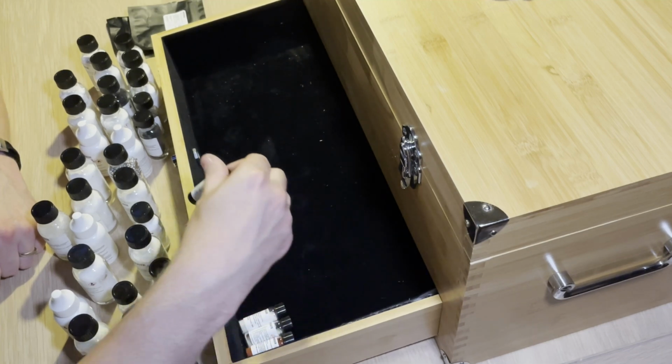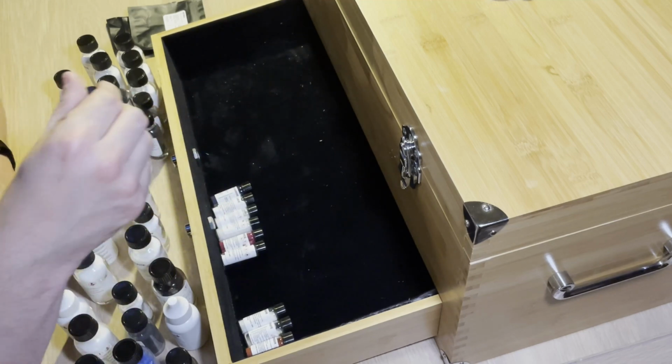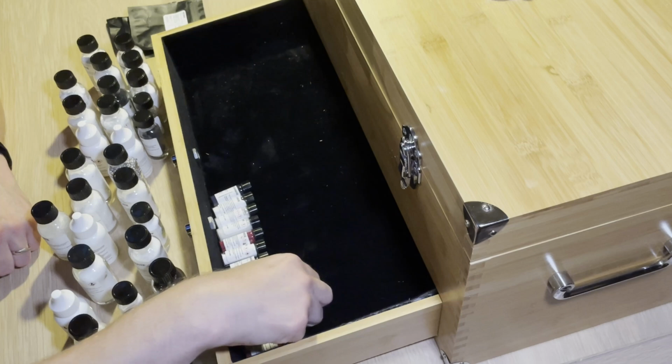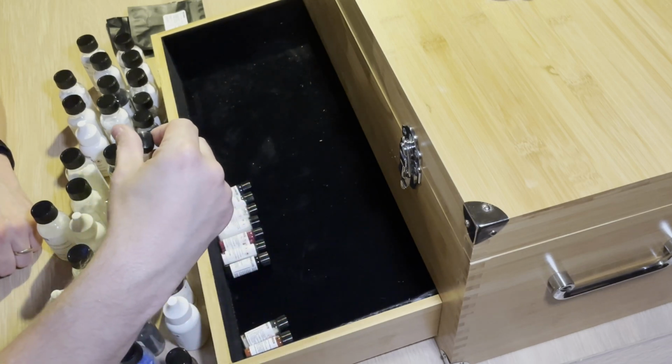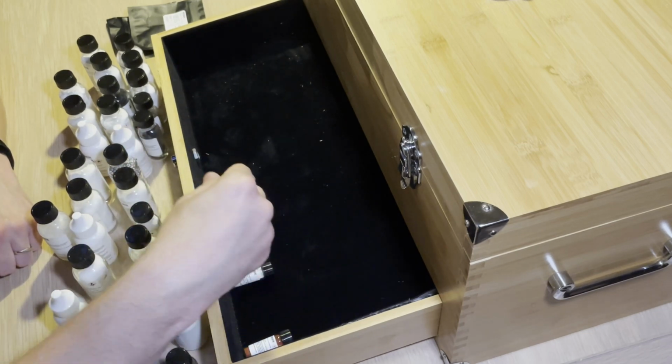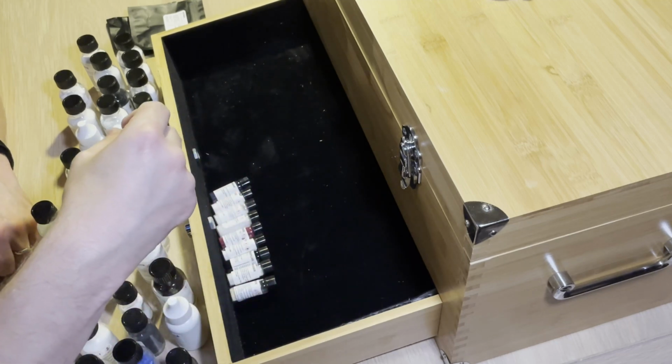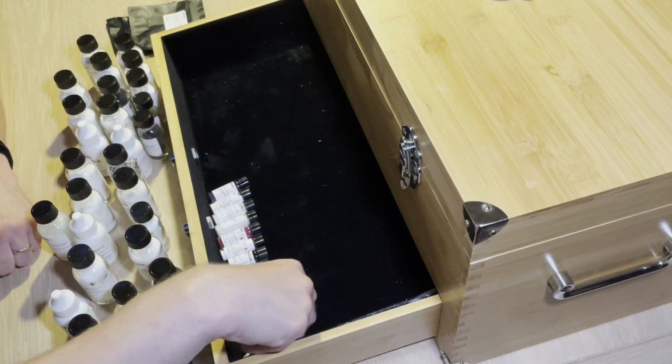That's gonna be fun. Ferrofluid is that fluid that you can basically use a magnet with. Potassium iodide, silver nitrate, fluorescent powder, and calcium metal.